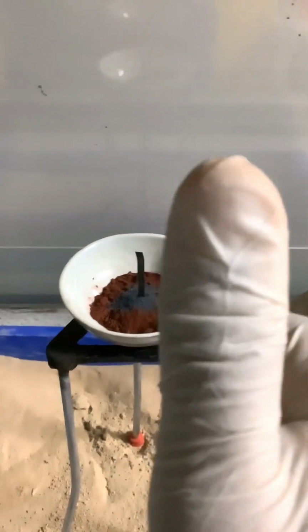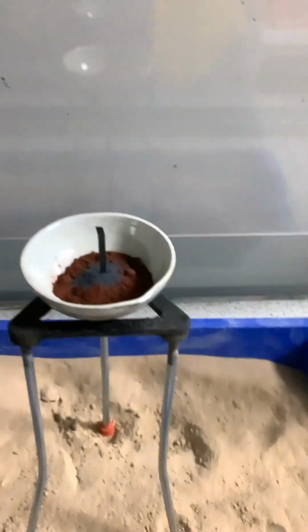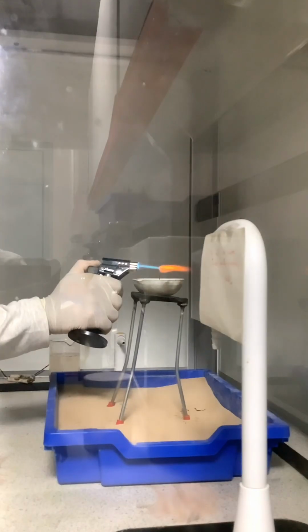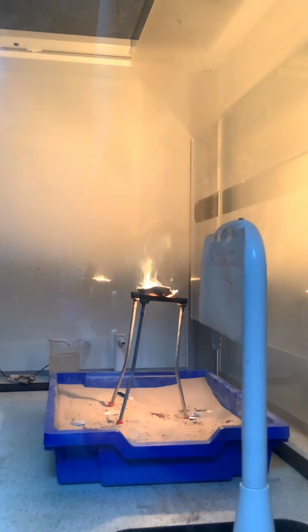Our next step is to light the flame and see what happens. So let me light it and show it to you. As you could see, the experiment blew up.